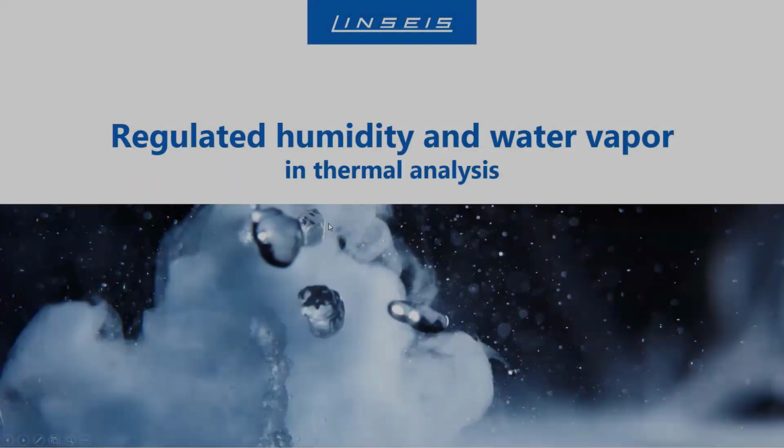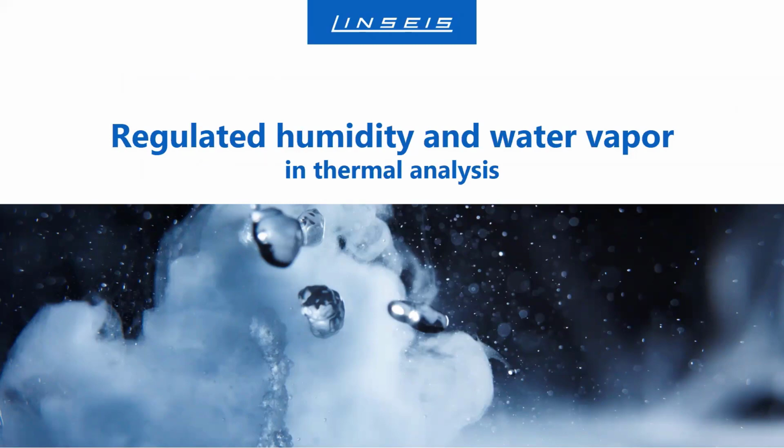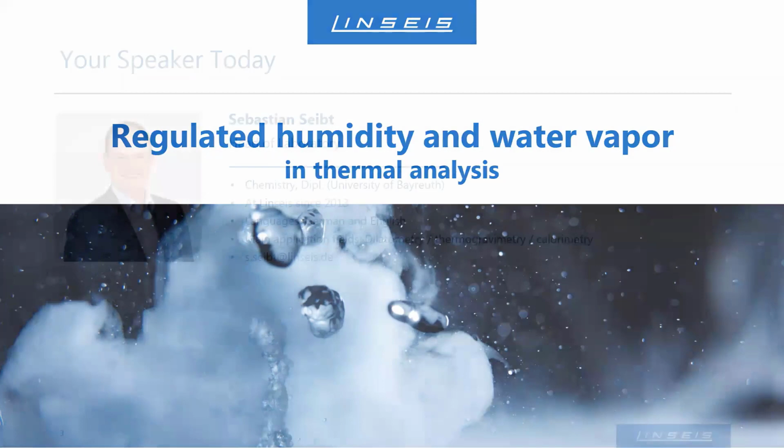Today's topic, or this week's topic, will be regulated humidity and water vapor in thermal analysis. In detail, it's more or less the difference between humidity and water vapor in thermal analysis, what this presentation is more or less about.